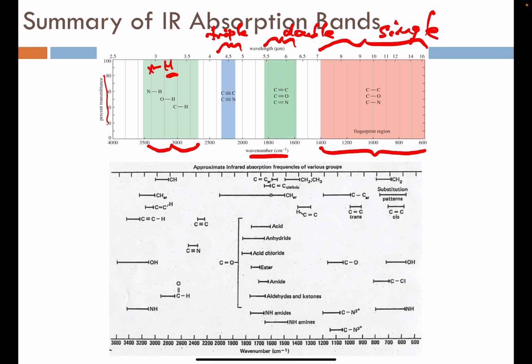Another resource with more detail is shown here. So here you can see that we can put much more detail to this still and move past generic labels like double bonds and elaborate to the type of functional group containing those double bonds.